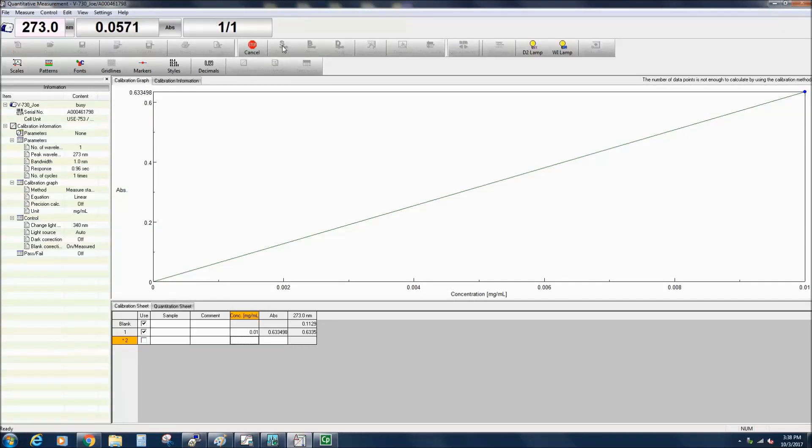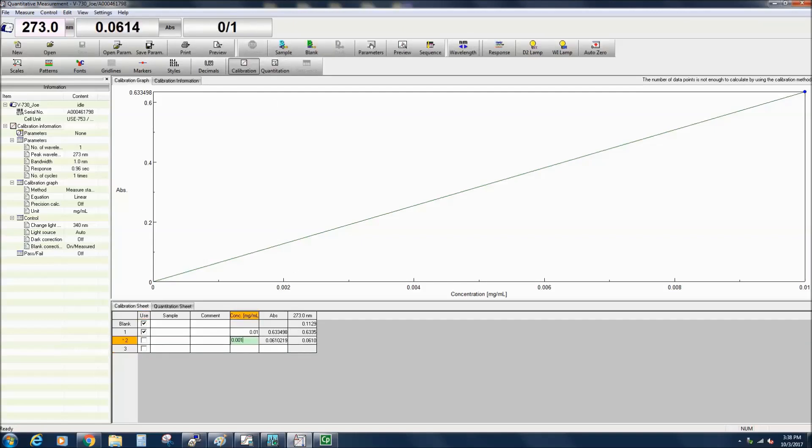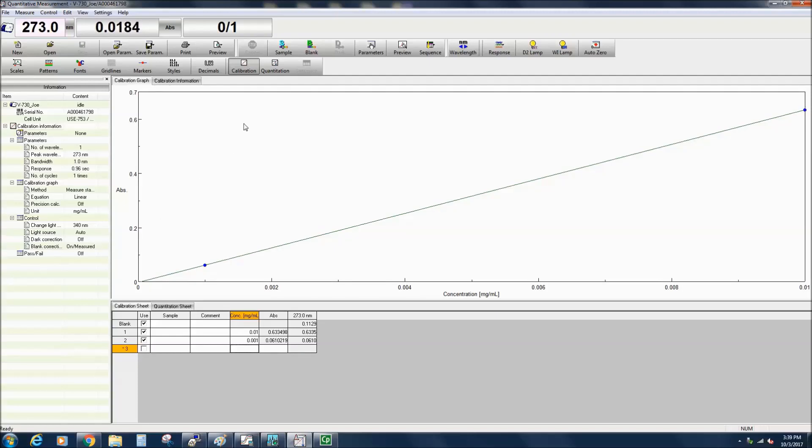If you do not wish to use one of the measurements in the calibration curve, deselect the Use box. If you wish to remeasure a specific standard, select the row number to be remeasured, confirming that an asterisk is next to the row number, and select the sample measurement icon. Continue this process until all standards have been measured and the calibration curve is completed.